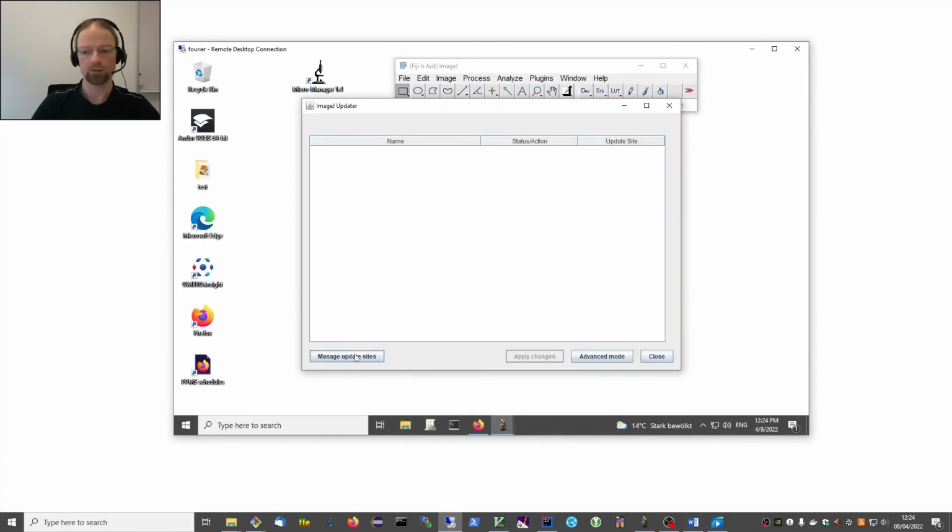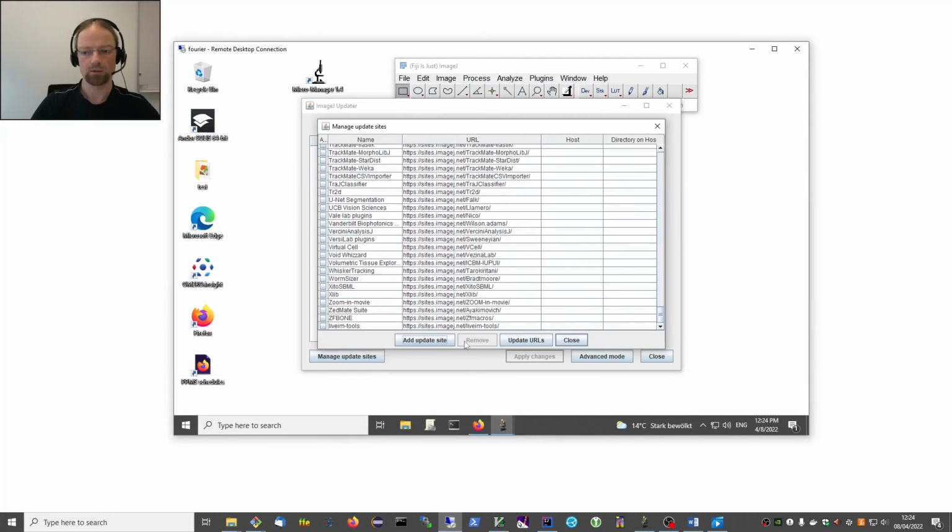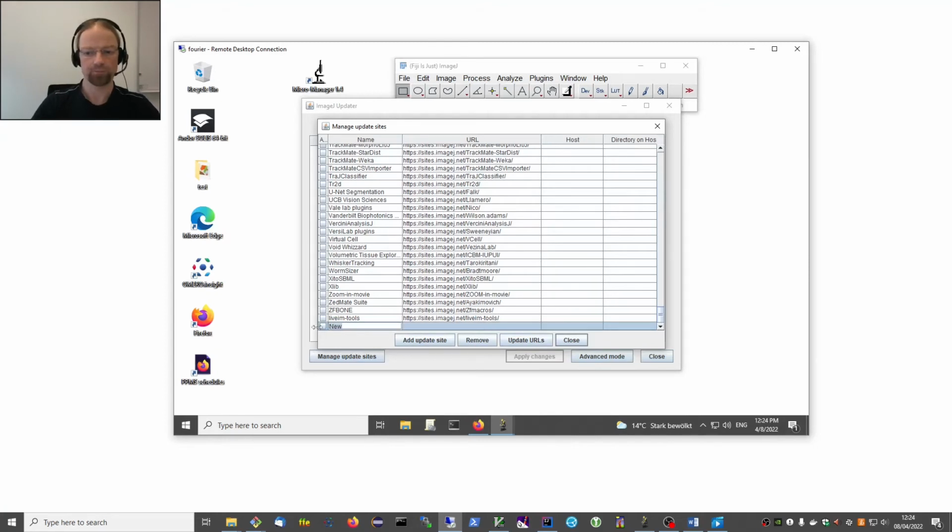And let's go to Manage Update Sites. So we need to add another update site here. So I click on Add Update Site. I will call it 3Dscript server.